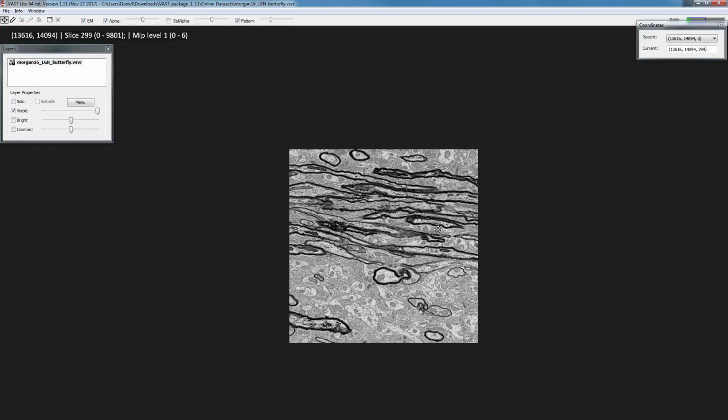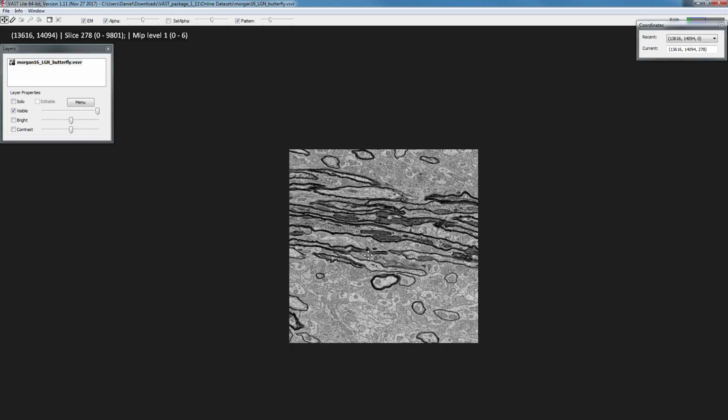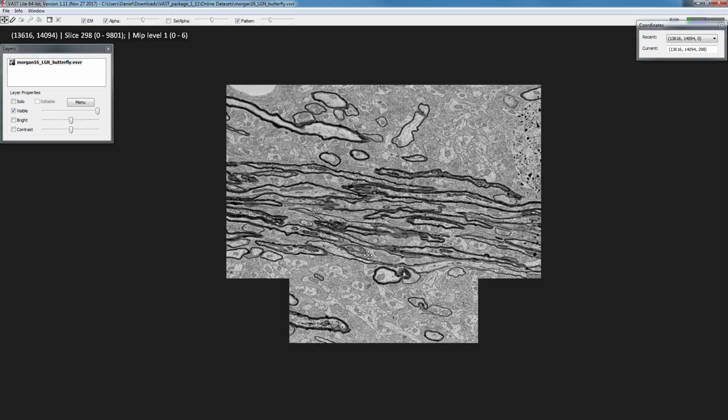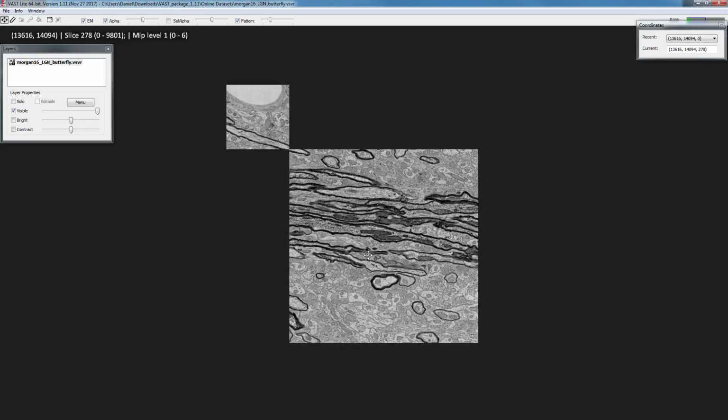The images are loaded from the center outwards so that you can always see where you're at most quickly. I'm just clicking A repeatedly to go up or down. I can just hold it. If you're left-handed like me, then you would use the up-down arrow keys on the right side of the keyboard to do the same thing.